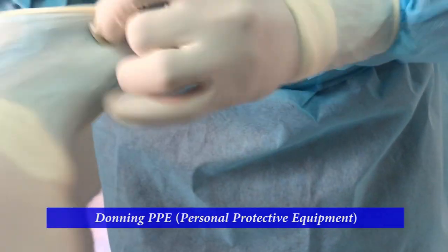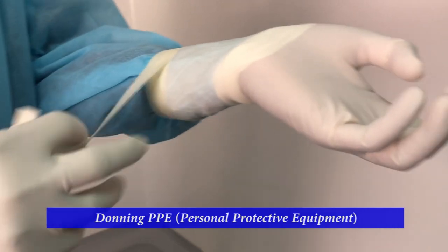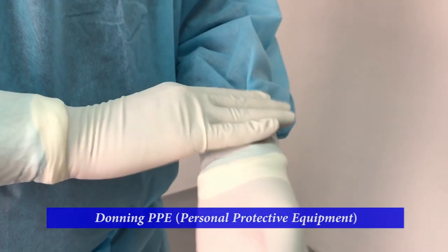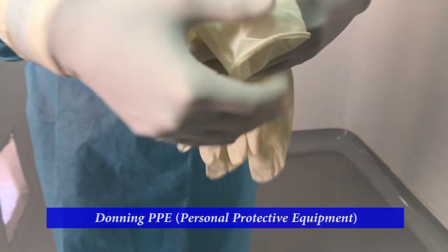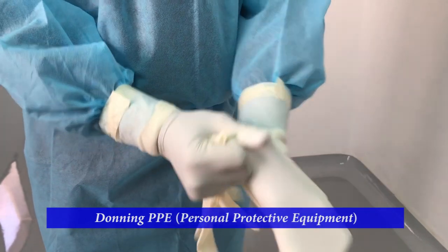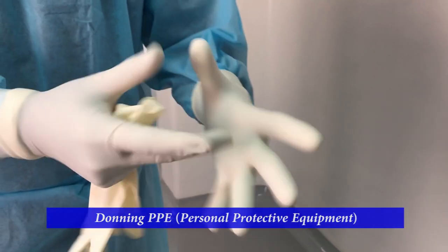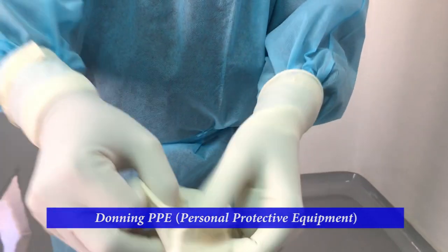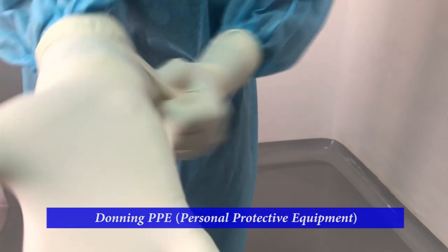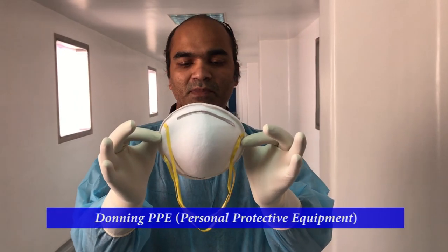Wear the lab apron and tie them up. Don the first pair of gloves and pull above the sleeves of the apron with the cuff of the apron well below the gloves. Tape the gloves to the apron sleeves using Abro tape. Carefully fold the end of the tape for easy removal while doffing. Don the next pair of gloves, which is the second pair, and check hand for snug fitting of gloves.